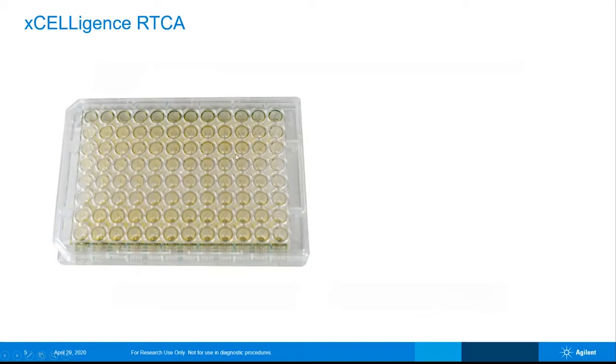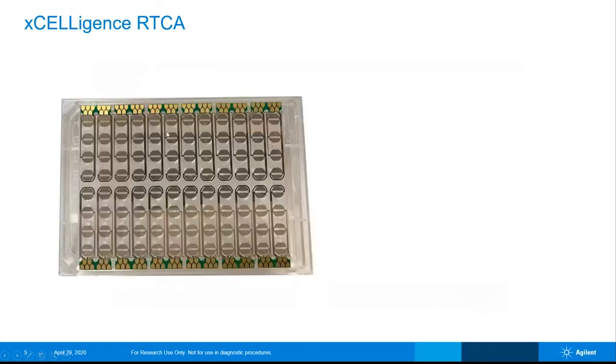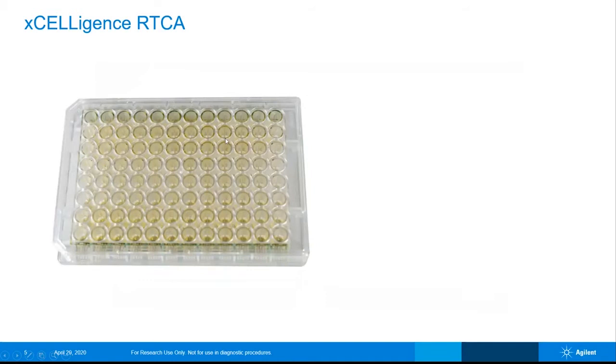So if you look at the underside of this plate, you'll see that all 96 wells have a gold biosensor array that is integrated into the bottom of the well. These plates come with either glass or plastic bottoms. I'll talk more in detail here in the next slide about how these biosensors are working. But for the moment, what I'd like to say is just that you would load cells and virus and drug into these wells as you would in any other assay.